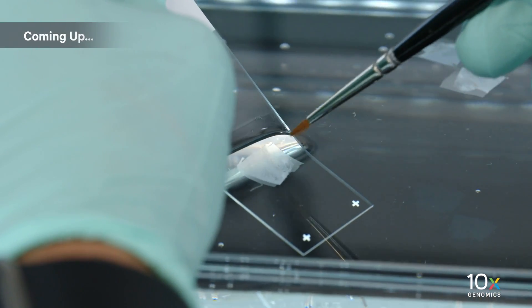We have collected the tissue sections. Next, we will place the sections on glass slides.